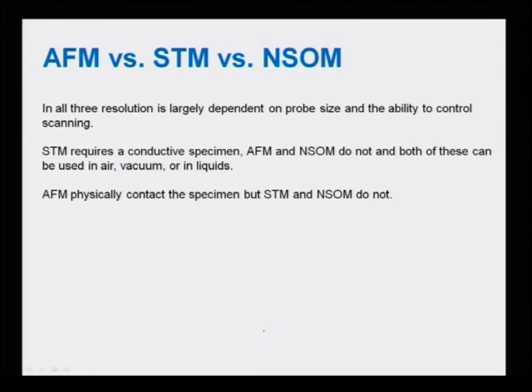To compare these three different techniques, AFM, STM and the NSOM, I would like to tell you three things. In all these three techniques, resolution is largely dependent on the probe size, that is the tip size. In case of AFM and STM it is the tip size, in case of NSOM this is the aperture size. STM requires a conductive specimen, AFM and NSOM do not require it, and both of these can be used in air, vacuum or liquids, but STM needs to be used only in vacuum. AFM physically contacts the specimen in contact mode, but STM and NSOM do not. So AFM in the contact mode can damage the specimen surface, contaminate, but STM and NSOM will not.